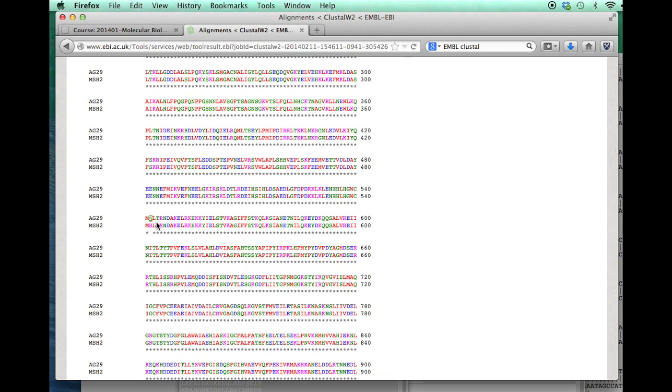So here we have a mutation from arginine to proline. It's a pretty serious missense mutation because proline will normally disrupt the secondary structure, and R is originally a charged residue, but proline is a cyclic one. So the mutation is at position 542, and the change is from arginine to proline. Originally it's arginine, and now it's changed to proline, and this is the R542P mutation.